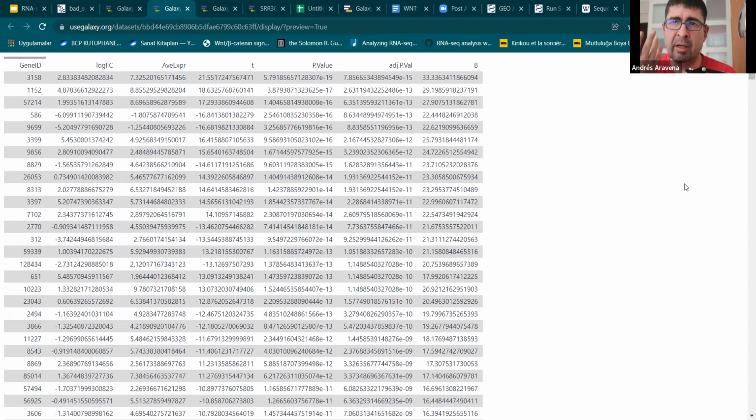The probability that that one read exists or not is very small, but the effect is very big. So in general, low expressions are noisy. I don't know if you remember when we plotted the banana plot, the low concentrations were always more spread. When you see something few times, it's very hard to make a conclusion, to generalize.